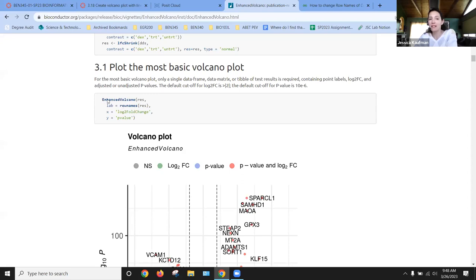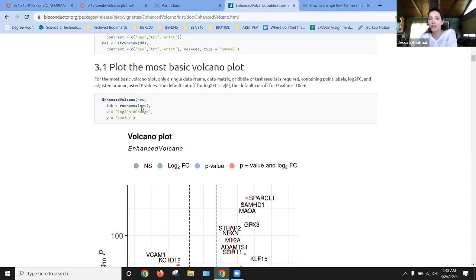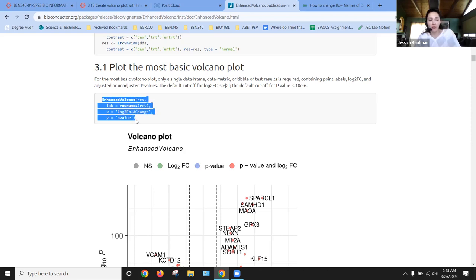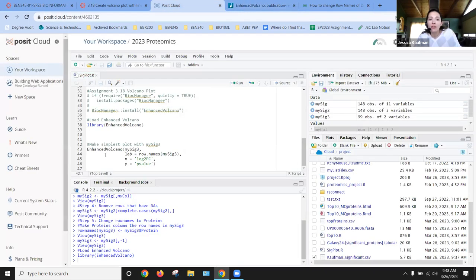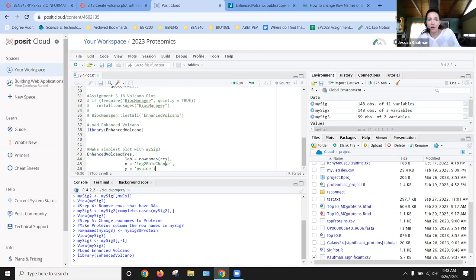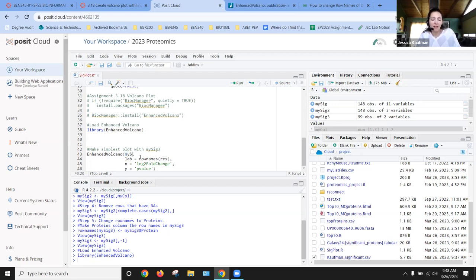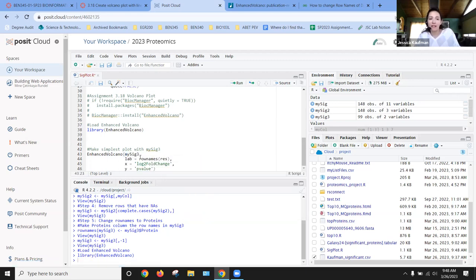This is the command. I just copied and pasted it into my script and then changed each individual part. So we can look at enhanced volcano. I'm just going to walk you through this. The results, R-E-S, that's the data frame where our data is. For us, that's going to be called mySig3.